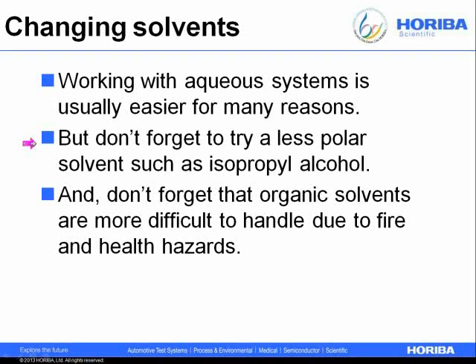And in dynamic light scattering, the volume of liquid is generally small, 2 to 3 ml at most, and so it's a lot easier to work with organic solvents than when you're using laser diffraction. But keep in mind that they are more difficult to handle, and they pose safety hazards that you need to address explicitly.